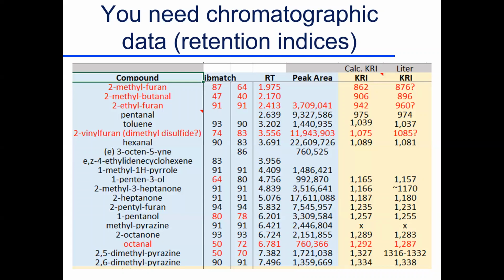And let's say that's 730. It's the 7th hydrocarbon, and it's about 30% of the way there. And so this is a retention index, and that is exceedingly useful. That's what I've added on to the table.